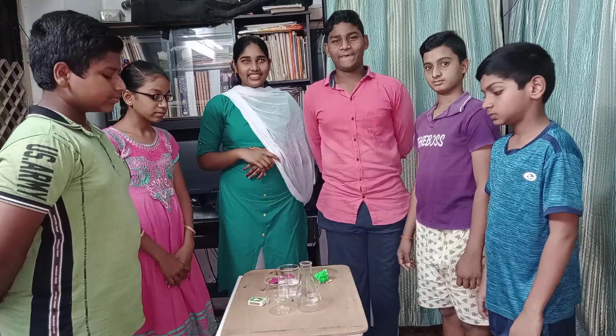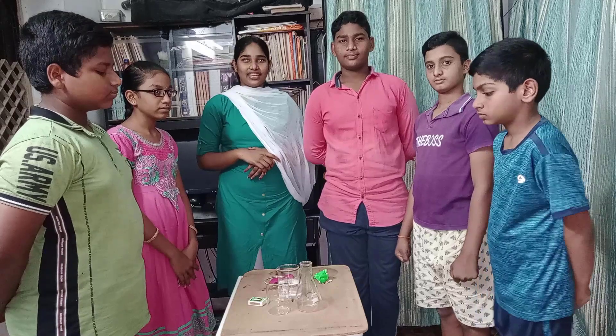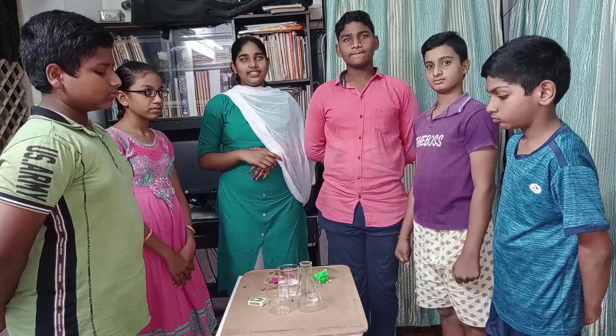Hi friends, we are studying 9th standard in Bages Academy. Today we are doing an experiment on chemical reactions and equations. Chapter 6.